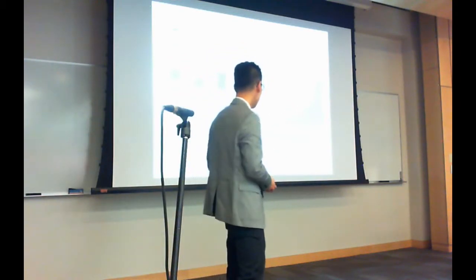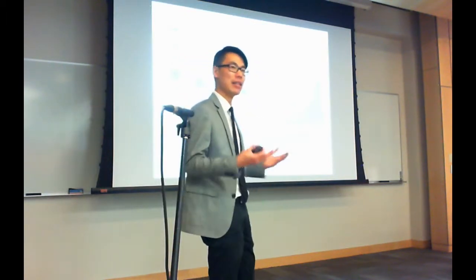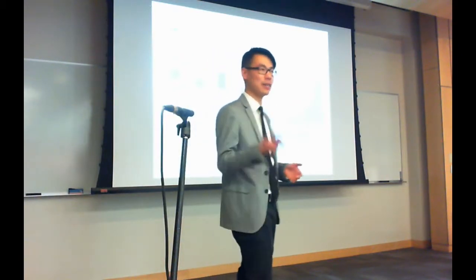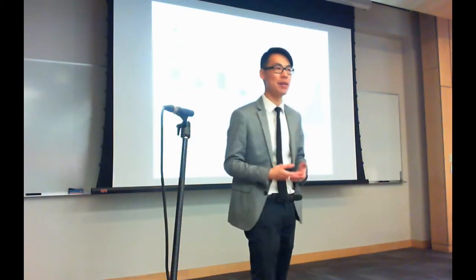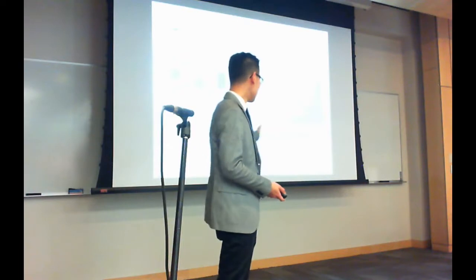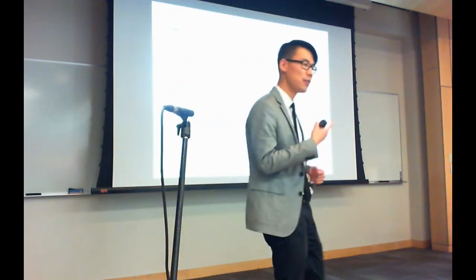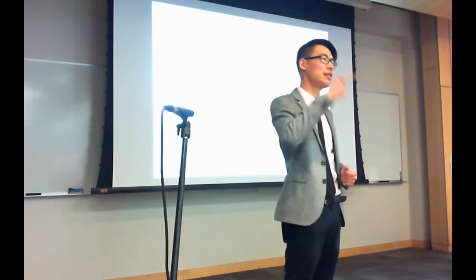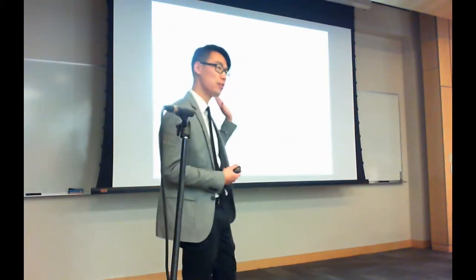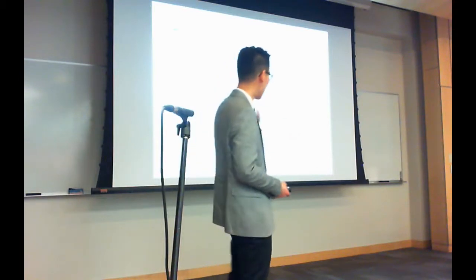And so this is highlighting the size of the libraries. And that's great and all. But one of the uses of a spectral library is identification. If we don't actually identify anything more, who cares? And so when we take the massive knowledge-based spectral library that we've generated and search it against real data, in this case a HEK293 cell line with about 1 million spectra, we filtered the results down to 1% precursor level FDR.